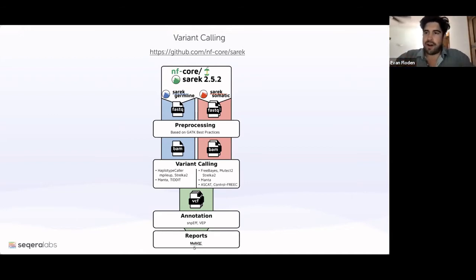No, it's really running batch-like computation. And it's typically batch-like computation where you have distributed compute, where you've got many different tasks that you maybe need to farm out, maybe need to send to your cluster or send to your cloud, and manage it in this way. So this is a very typical kind of example, but this is very idealized. You can see here, this is running some GATK best practice pipeline.